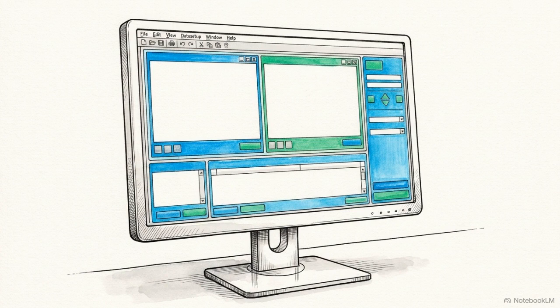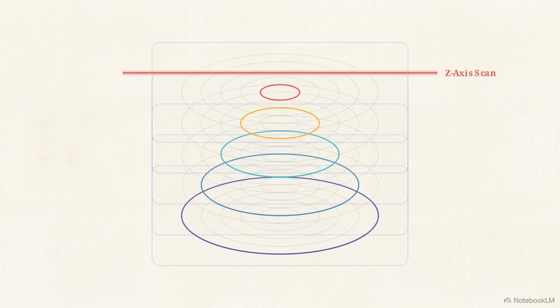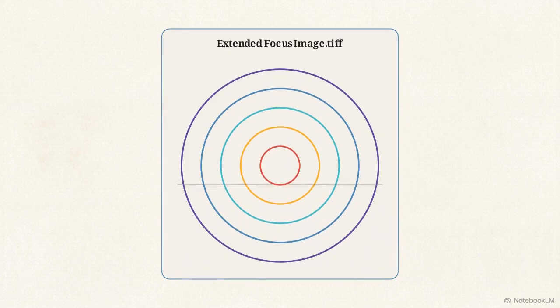This dashboard shows our starting point. Before initiating the protocol, verify 3 mandatory prerequisites. The BX61 microscope must be powered on, your physical sample mounted on the stage, and the stream motion software active on your screen. Executing this protocol correctly allows you to stop capturing incomplete visual fragments and instead render the entire structural truth of your sample in a single file.